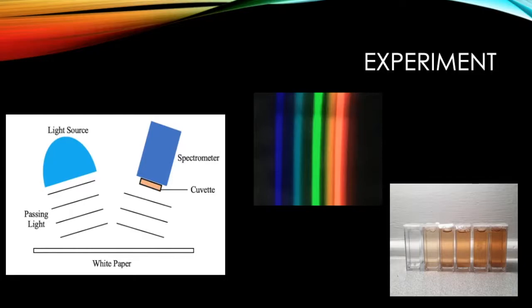The cuvette with the particular experimental solution of T was attached with putty directly in front of the opening in the spectrometer, allowing the light to pass through and only through the cuvette into the spectrometer. This can all be seen in the first diagram. Once this was set up, an image of the spectra was captured on an iPhone 6s.